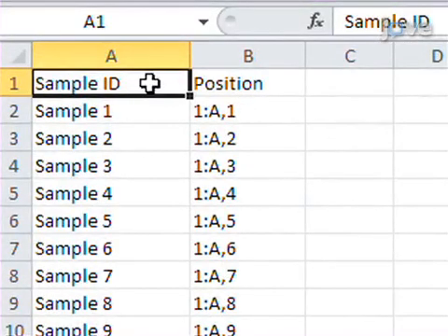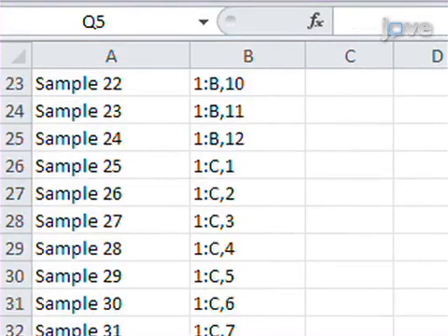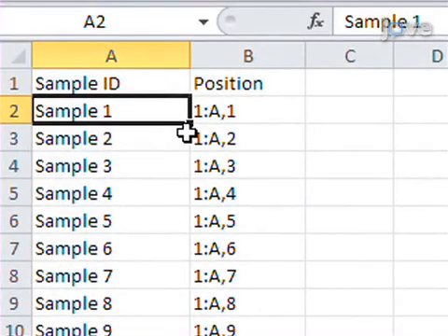extracts. To create a plate map for sample preparation, open a spreadsheet. In the first column, enter the sample list in order of loading. In the second column, enter the 96 well plate locations using correct nomenclature for your autosampler software. Save one well in each plate for the QC sample.